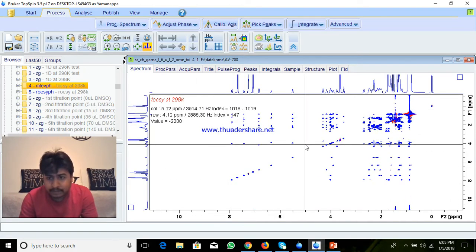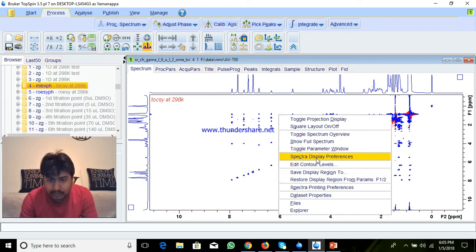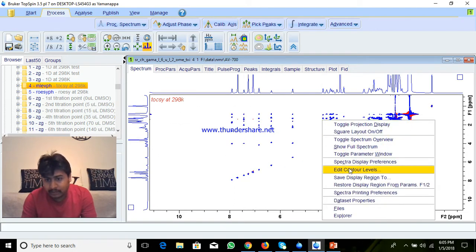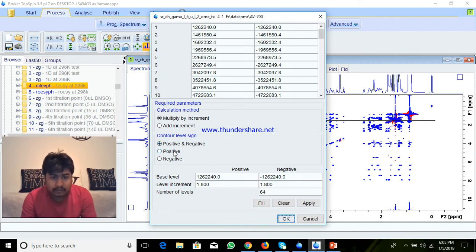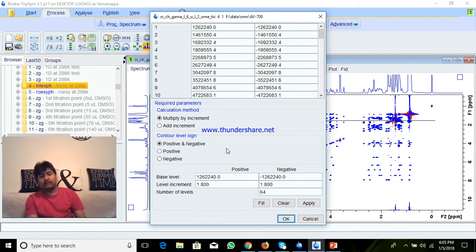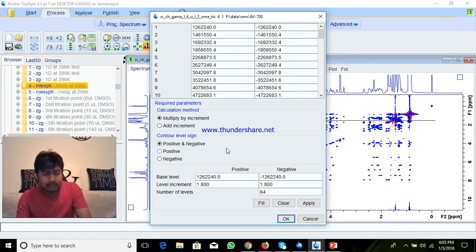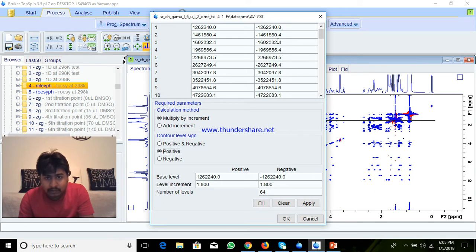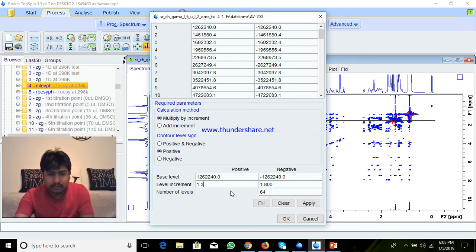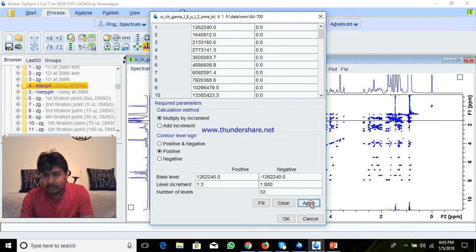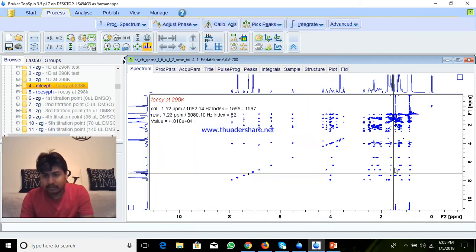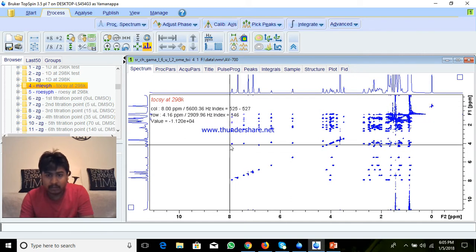After this, another thing you can do: right-click and Edit Contour Levels. Here you can take positive or negative — if you have a ROSY spectra you need positive and negative; if you have only positive spectra, then you can select only positive, because here a negative value is there. In Level Increment, you can give 1.3 as increment, and you can give 32 or 64. Apply, and it will remove the negative points from the spectra, and you will get only positive.